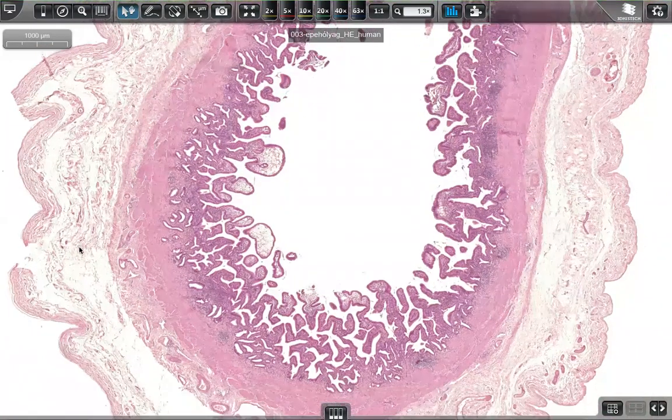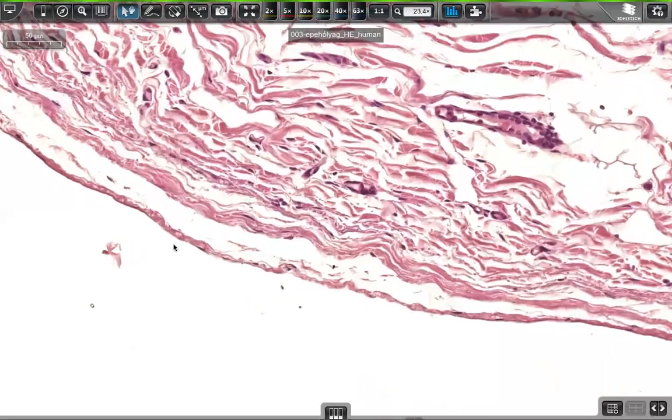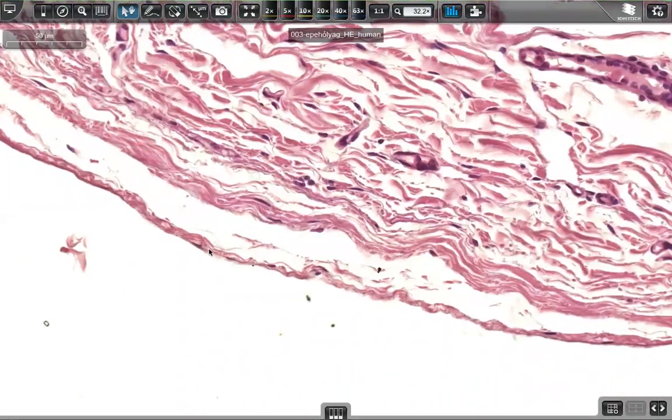If we can find a really sharp covering externally, that is a serosal covering. The gallbladder posteriorly represents peritoneum, therefore serosa, and that side which faces the liver isn't covered by peritoneum, so it represents adventitia. So now we are looking at the peritoneal covered side.